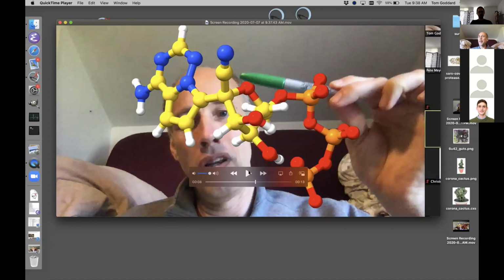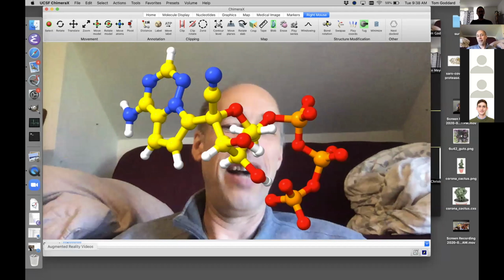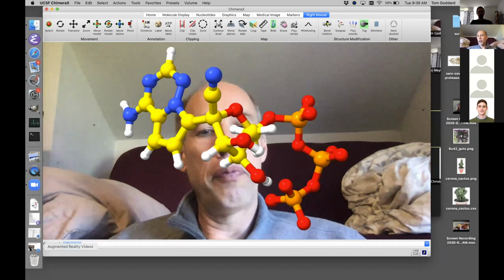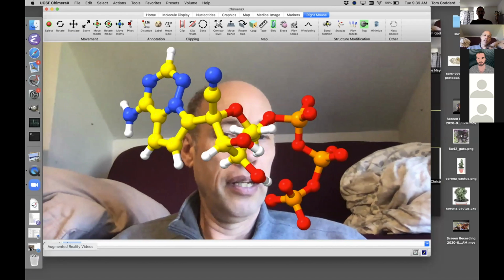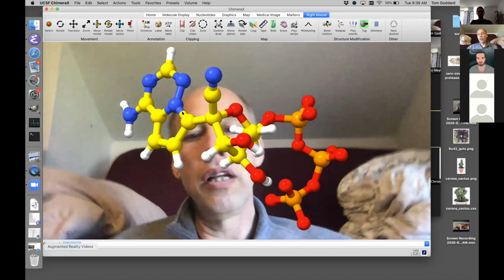When I'm showing you this augmented reality, I've been showing it to you live, and I guess it could be used that way. If you're quarantined at home and your PI wants to know what the latest findings are of your studies of your protein, you can connect by Zoom and actually show them what you've been looking at. You could do it live. But I've mostly been thinking you would prepare a video to explain the science that you're doing. And as I said, you could even include this as supplementary information on a journal article, say.